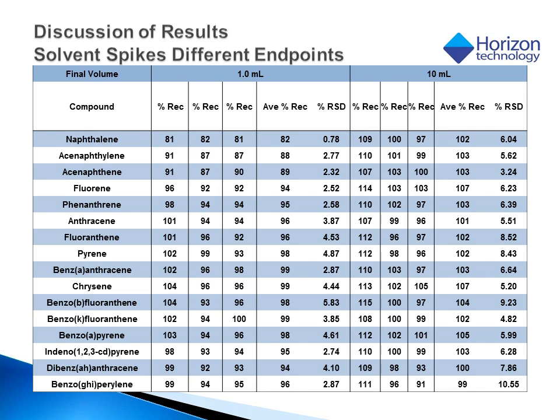Recovery ranges from 82% to 99% for the 1 mL endpoints, and all around 100% for the 10 mL endpoints were achieved. The effective concentration was studied by preparing solvent spikes. 30 micrograms of PAH standard mix were put into EV tubes containing 30 mL of acetone-hexane mix. The mix represented the solvents used to elute the SPE discs in these experiments. These measured recoveries of solvent spikes at 1 mL endpoints and 10 mL endpoints.